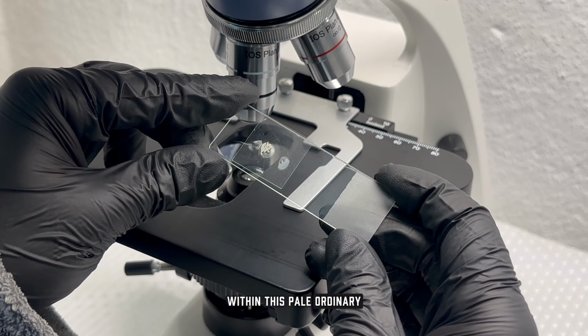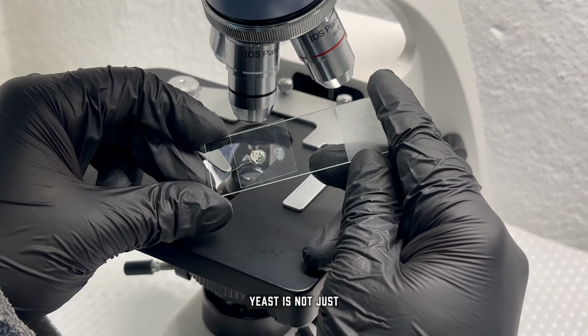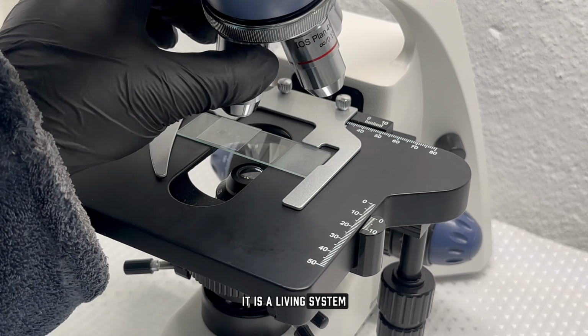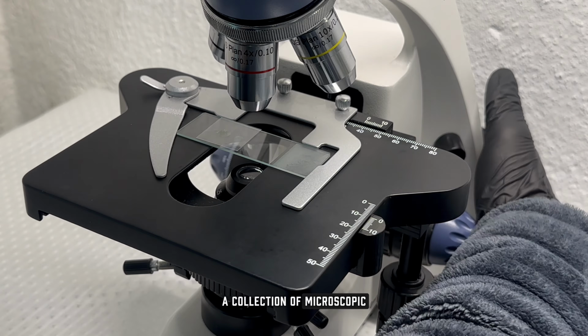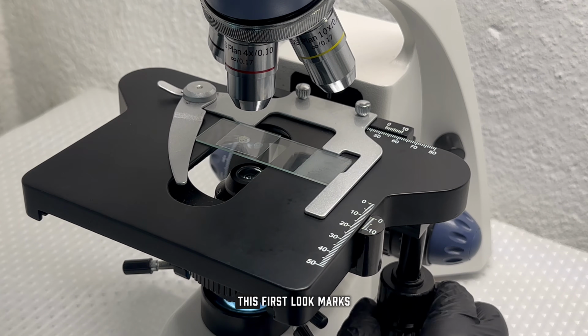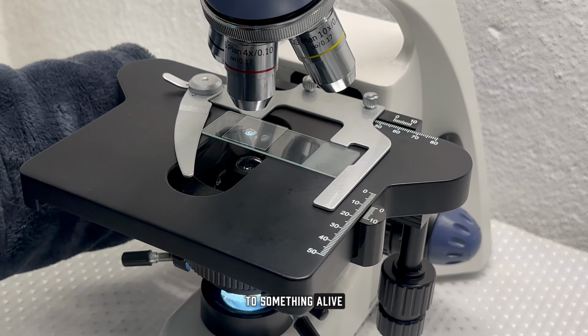Within this pale, ordinary substance exists a hidden structure. Yeast is not just something added to dough, it is a living system, a collection of microscopic organisms responding to their environment. This first look marks the transition from something ordinary to something alive.